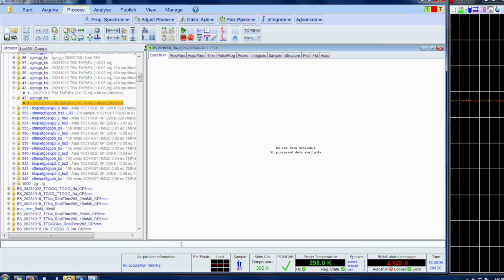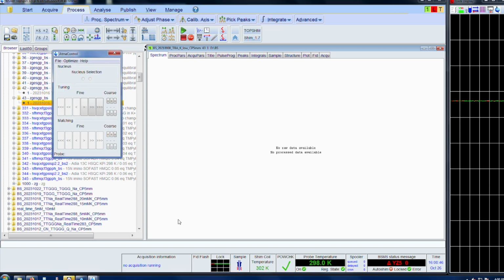In order to do this most efficiently, the first thing after having done the lock and shim is to do tuning and matching. What is tuning and matching? This is to ensure that the pulses that you're applying effectively get transferred to the sample and do not get dissipated. This is one experiment which has been set up with all carbon, nitrogen, and proton channels in it. So the first thing that I'll be tuning and matching will be the nitrogen channel, which you're going to see as a V that's going to come up any moment right now. It ends up loading different electronic components, as you're able to see in the status on the bottom left.